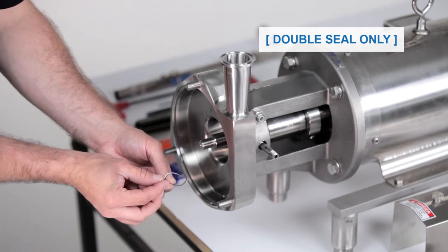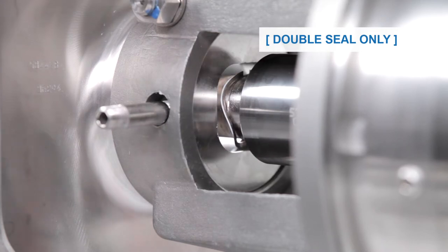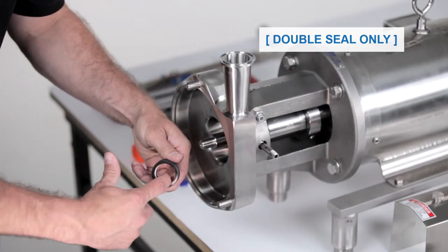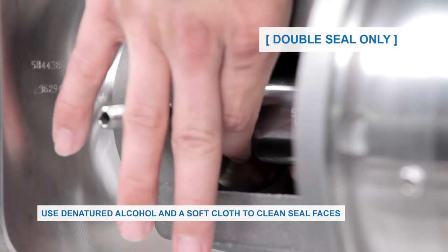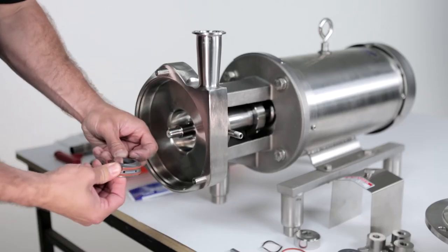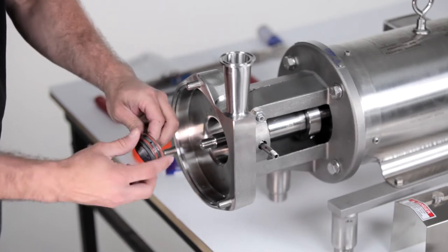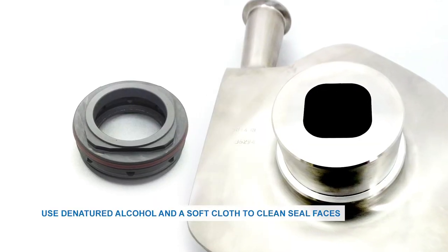Install the spring, ensuring that the spring sits entirely behind the shaft pins. The spring that has the white edge is the flush seal spring. Place the O-ring into the flush seal and lubricate. Push the seal onto the shaft, making sure the slots align with the pins. Install the stationary seal O-ring or O-rings onto the stationary seal and lubricate. Single seal pumps have one O-ring; double seal pumps have two. Install the stationary seal into the housing, making sure to align the flats on the seal with the flats on the housing.